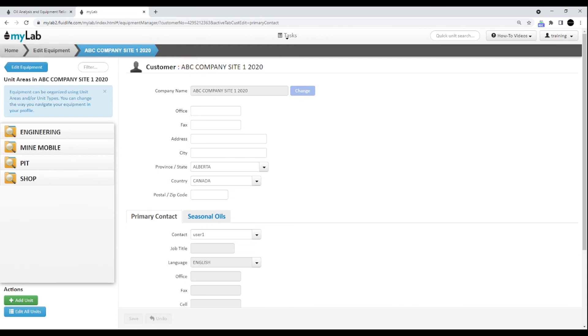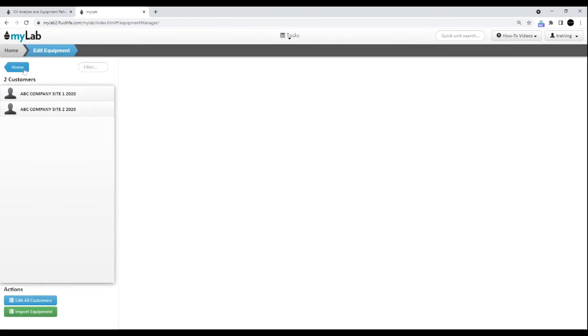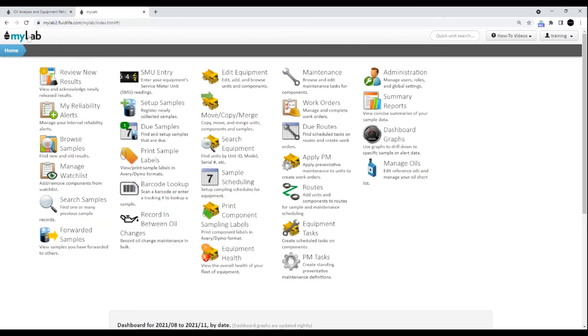You can get back to the previous page by clicking the blue back button, which in this case goes back to the edit equipment page. You can return to the home page by clicking the home button on the far left or the logo itself.